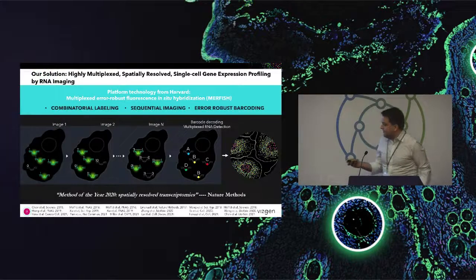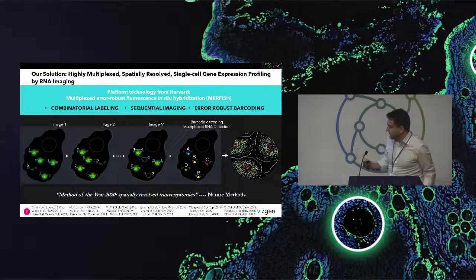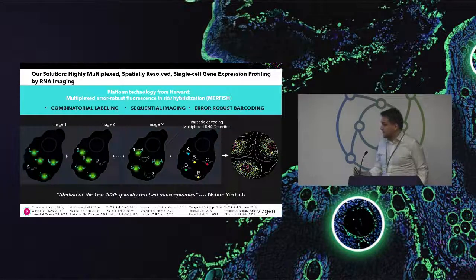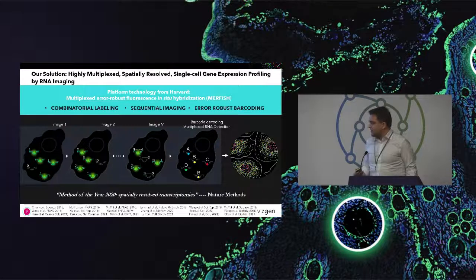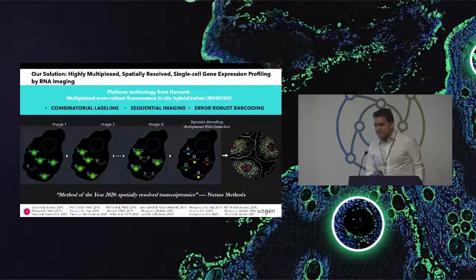So for example, here we just lay out the sequential imaging process. In the first image, we're reading out the first bit in the barcode. So any gene that was assigned a barcode with a 1 in this first bit position shows up as that single molecule FISH spot, while the ones with 0 remain dark. So we image this, record the image, extinguish the signal, and then restain for the second bit in the barcode. Now we have a new pattern of single molecule FISH spots corresponding with all the genes that were assigned a barcode with 1 in the second bit position. Again, we extinguish and then continue through the process to read out the full binary barcode.